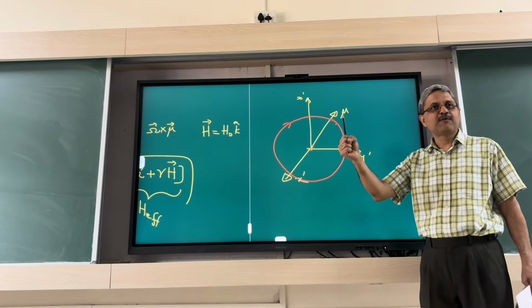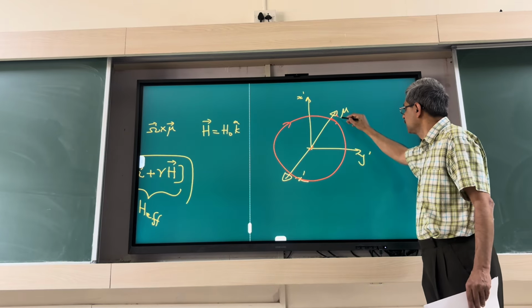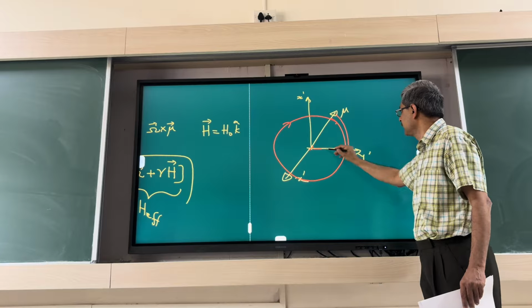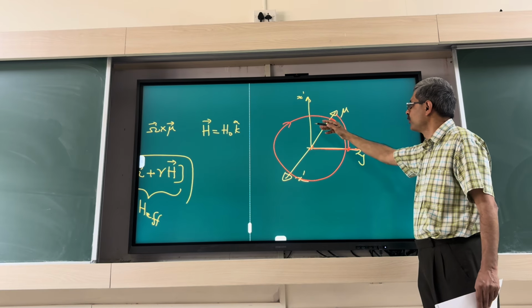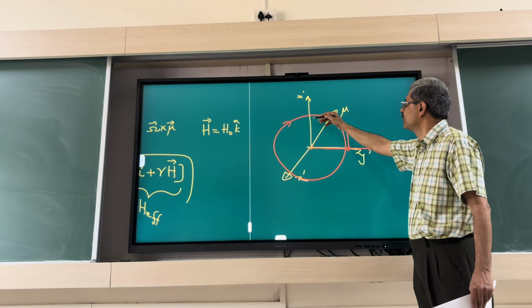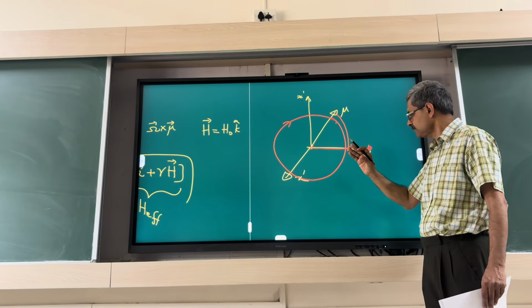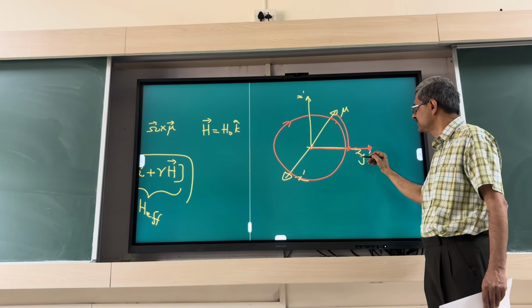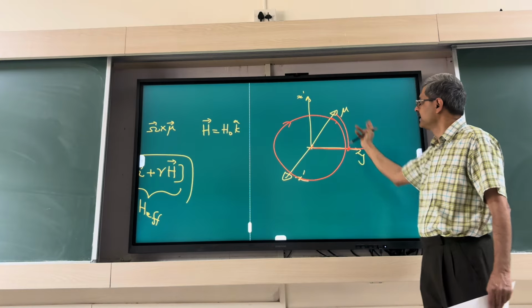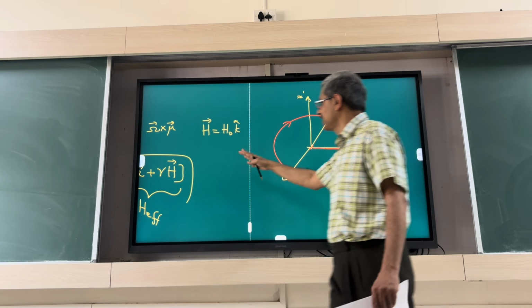If I put my RF on for some time and then switch it off, then for example this can come here and then it can point along this axis, right? So often we are probing the Z component. You start with the Z component to be something, and then if I keep my RF field on for some time, it will point along the Y prime axis. If I switch it off, it will again go back to whatever equivalent, and so on. So this is the classical description.